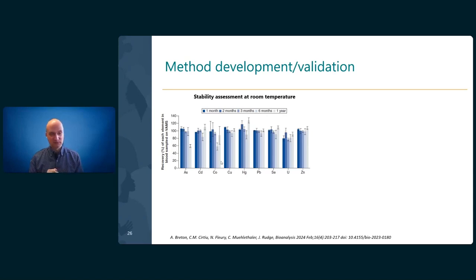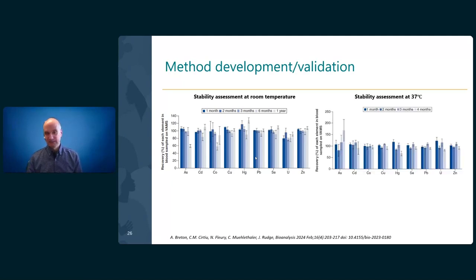So by applying a higher blank subtraction, the results are obviously impacted, and that's why we get a loss of arsenic after 1 year. But roughly after 6 months, we are still quantifying with very good results, so we're not worried. For cobalt, it's about the same thing. But as I said, most of them are very, very stable over time.